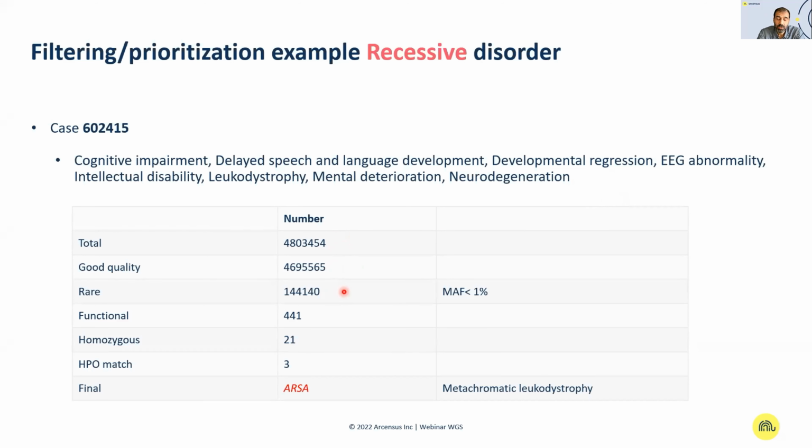And then when reducing or removing all the variants that are present at a high frequency in the healthy individuals, this is, as you can see, the major step, reducing the number to around 450 variants that are expected to be functional.